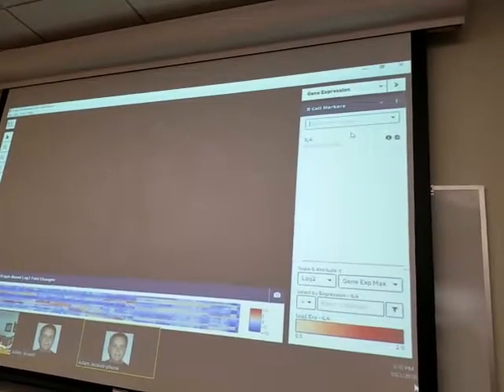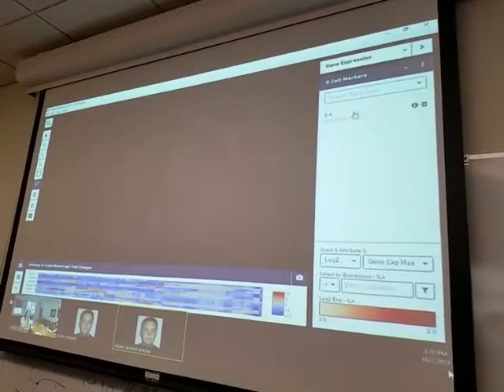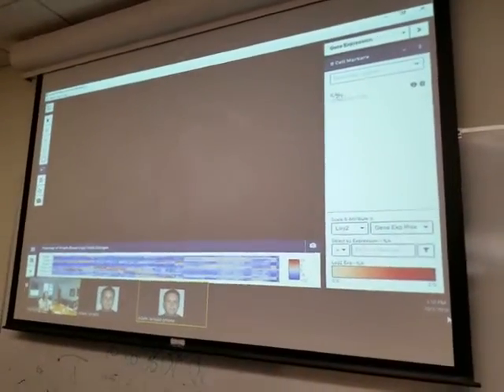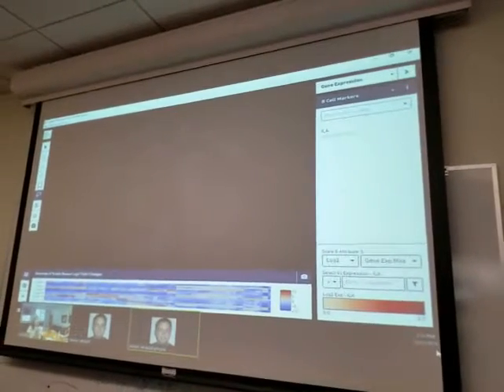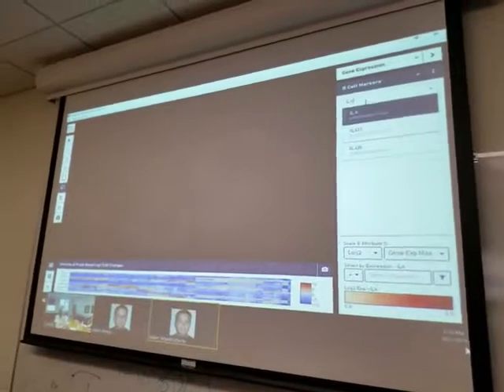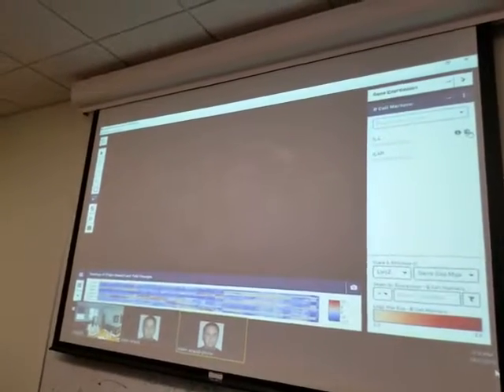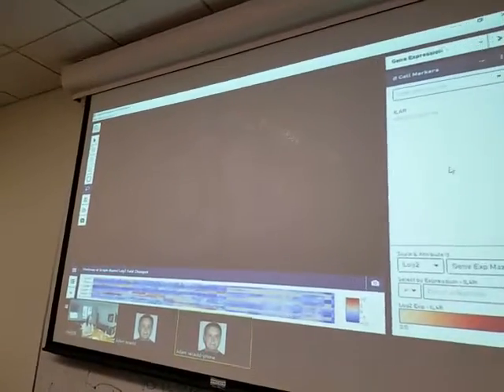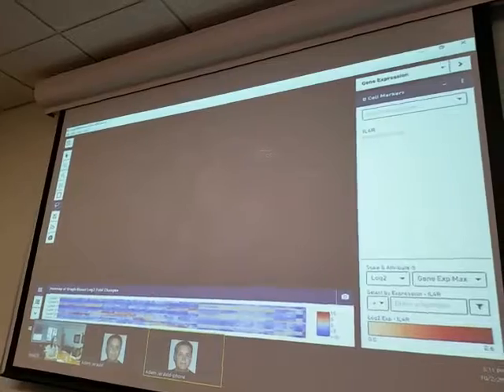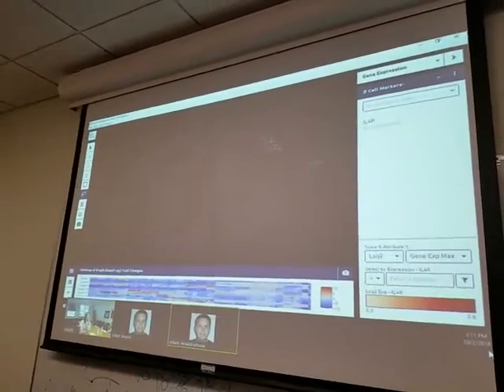Oh, I see. Well, okay, I have IL-4 receptor in this data set, and I don't know if this looks like yours as well. Yeah, it does not look like there's significant IL-4 receptor expression. You put the IL-4R. Yeah. That's it. Right, there they are. Just a few. So in this case, I'm seeing some in this population here, and then through this population.